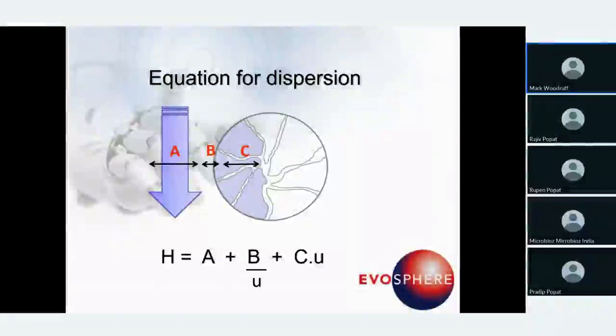So core shell particles largely worked on the C term, the mass transfer in and out of the pore structure, and how long they spent was much shorter than normal because these weren't fully porous particles. But because they weren't fully porous particles, the surface area is very low, you lose loadability, and therefore you have a problem when you want to scale up your methods.